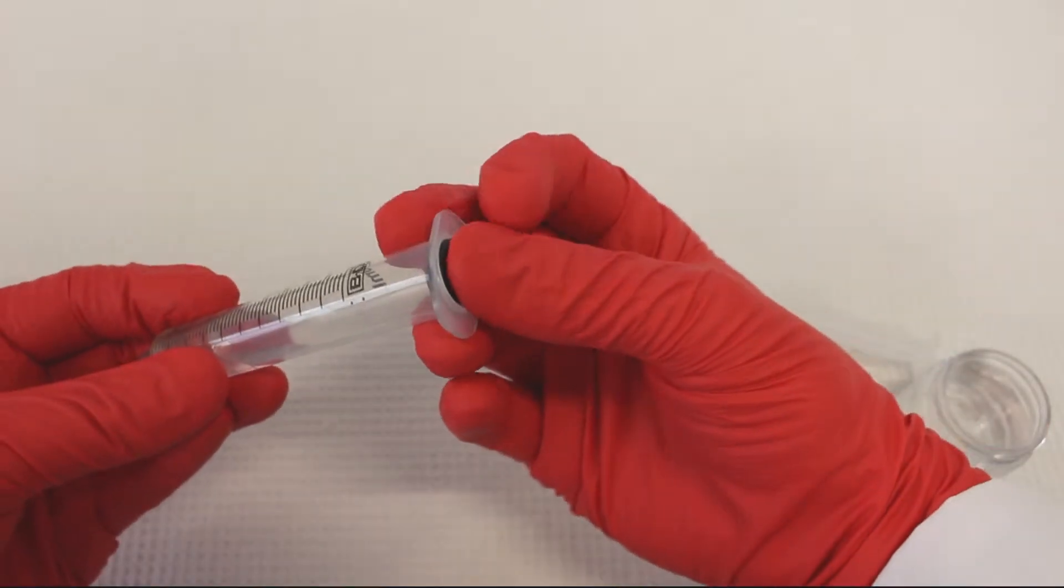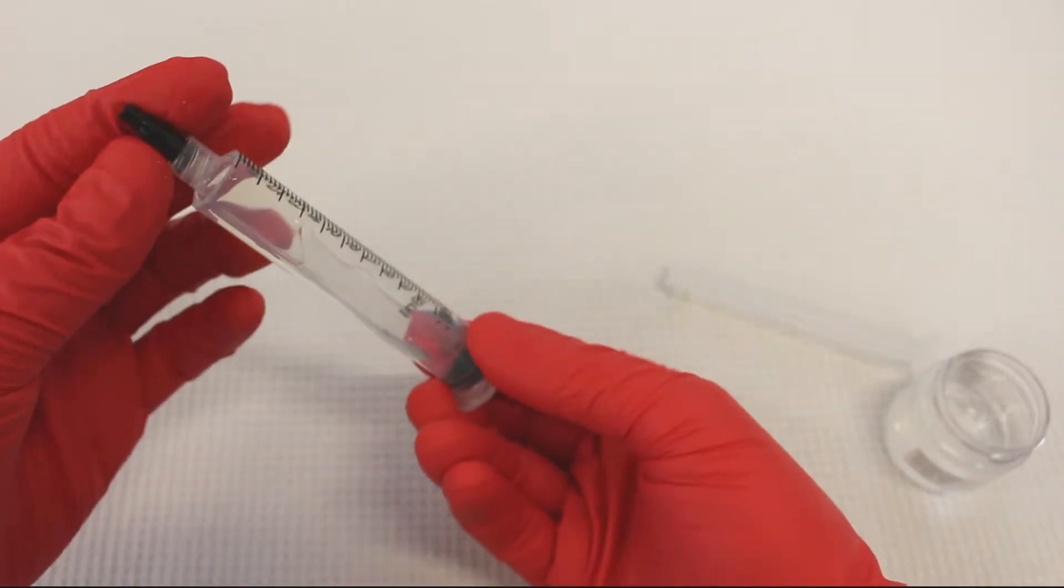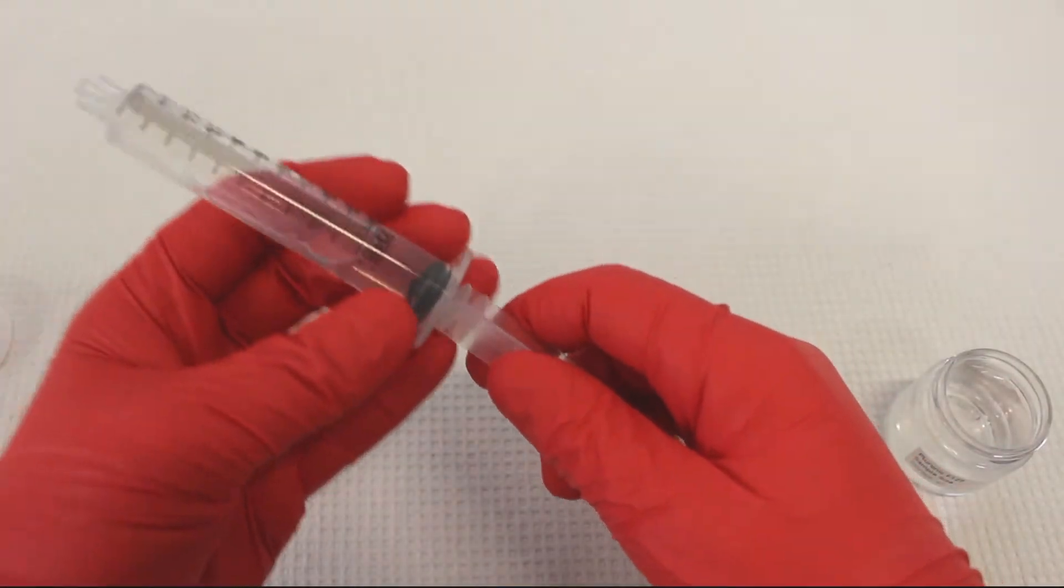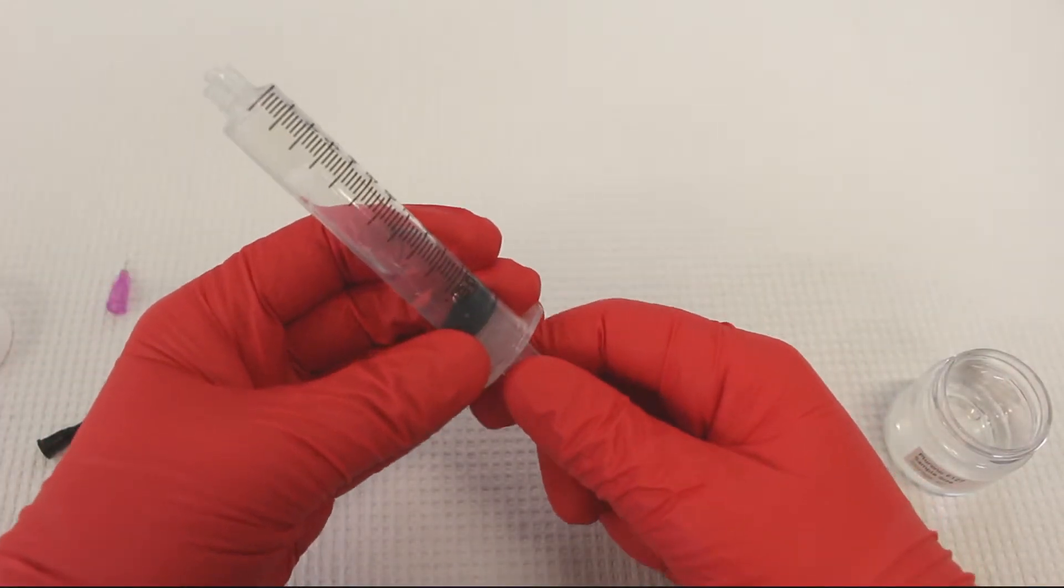Carefully add the black stopper to the top of the syringe. Invert your syringe, then remove the cap. Use the plunger to push the material and stopper to the top of the syringe.